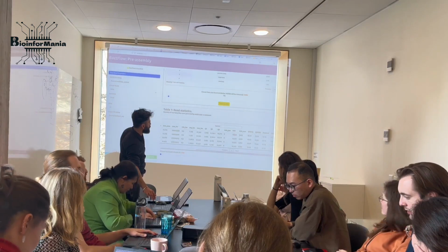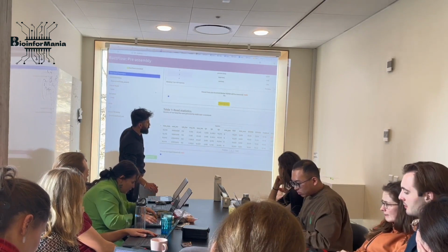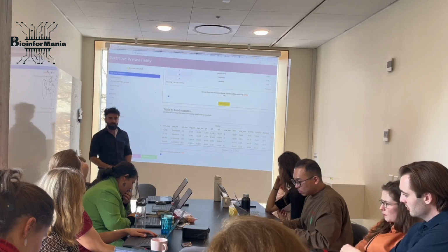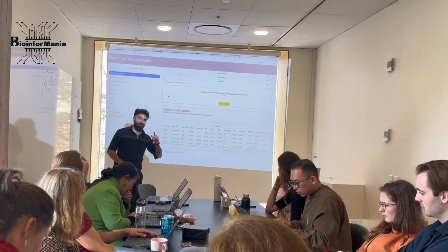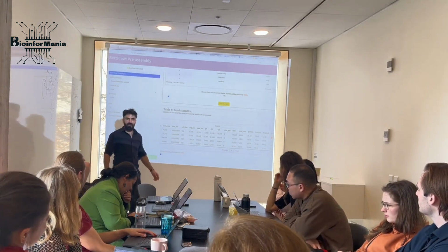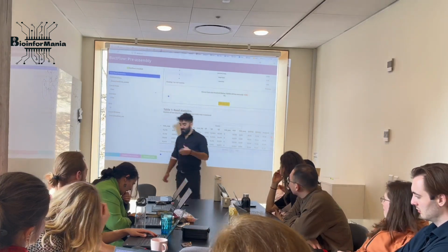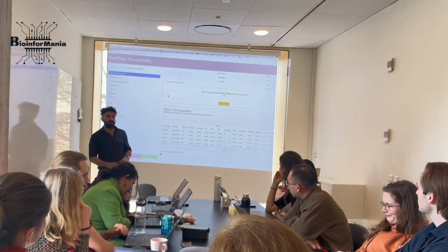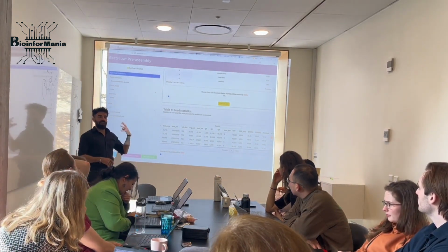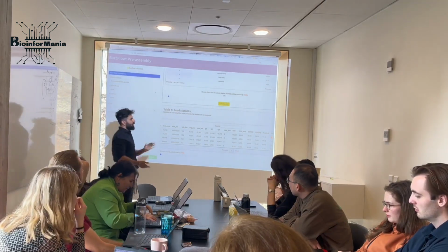And these are different quantiles. The most important part is this GC content. GC content is also sometimes used just to see how different two species are, how related they are. The same species have more or less the same GC content, okay? There are more things to talk about with GC content. If you have used a transposon, for example, to cut your DNA, the transposon has a high affinity to GC content, so it will be more shredded, okay? And things like this.